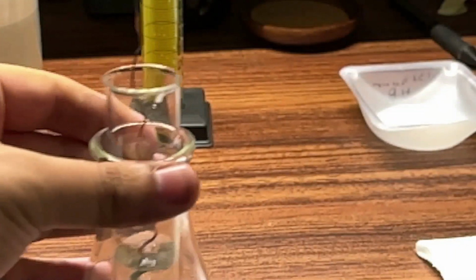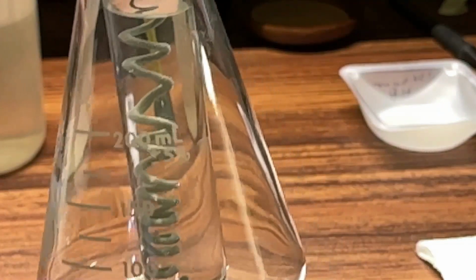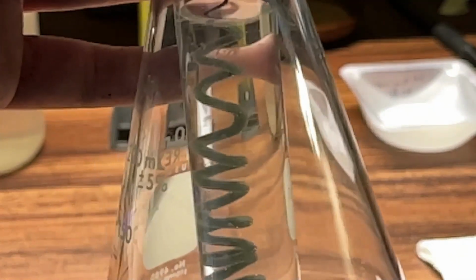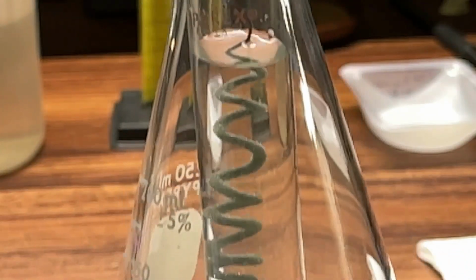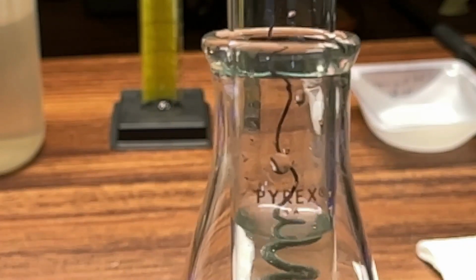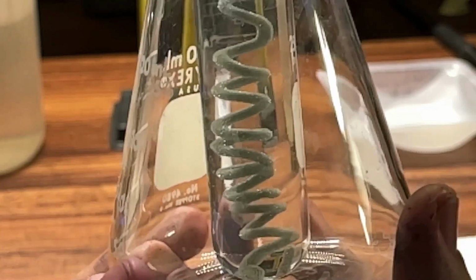So we can see immediately that the outside of that copper wire is getting covered with these crystals, and it really does look cool. Those are your silver crystals forming on the outside of your copper wire. We can see what it looked like before, right? The stuff that's not in the solution isn't reacting, but underneath, wow, look at that.